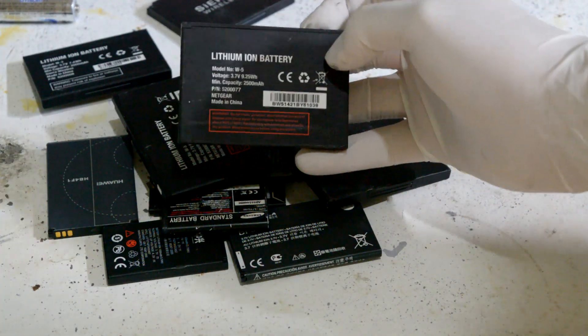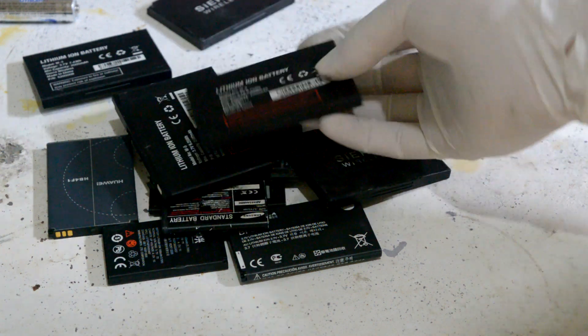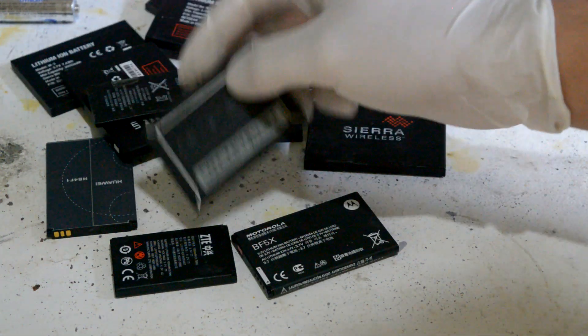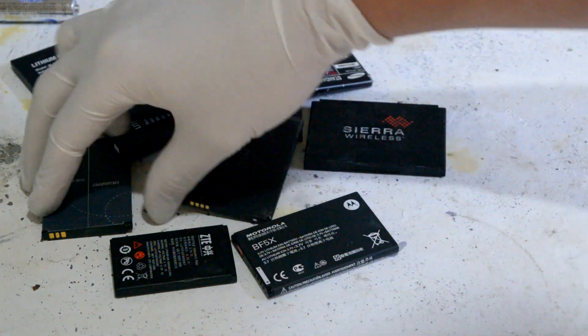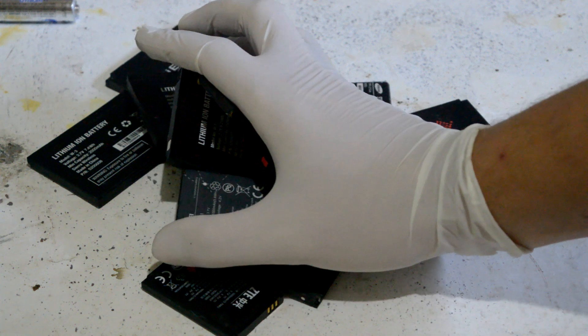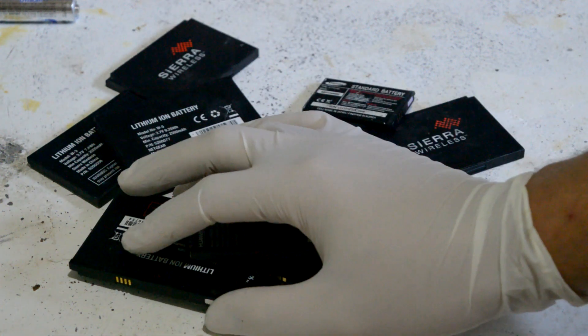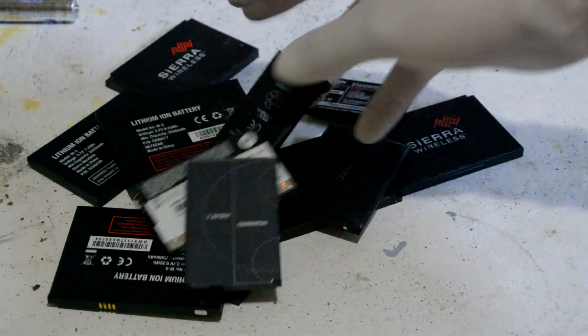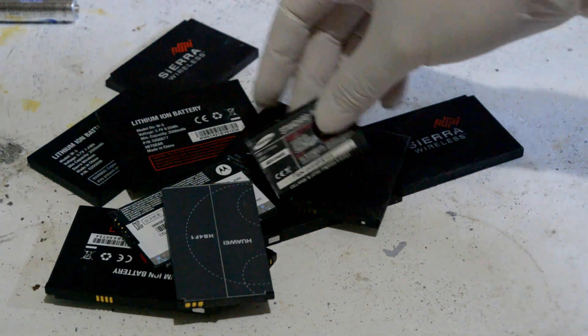So 0.4 grams of lithium is not very much and is quite hard to extract. However, I do have an anonymous contact who wishes to remain anonymous, who managed to get me a whole lot of phone batteries — so thanks Dano for that. This one here is 2500 milliamp hours, and this is 1400. I think it goes down to about 800 for some older batteries. All up, I have 23,600 milliamp hours of battery, which corresponds to about 7.1 grams of lithium.